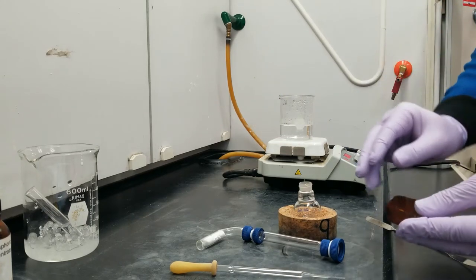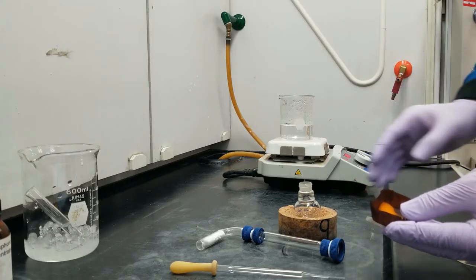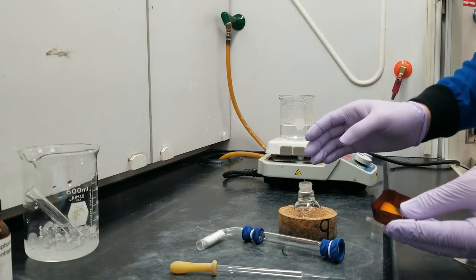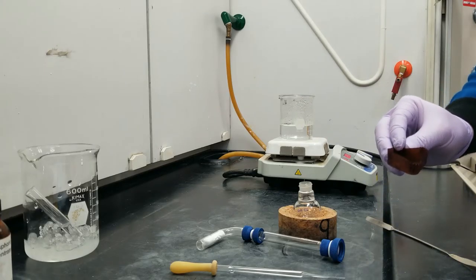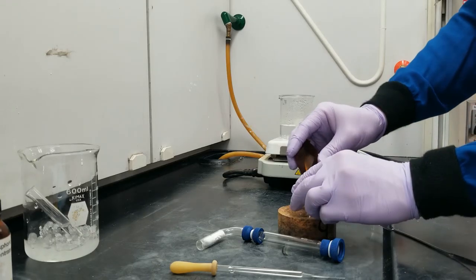And when we introduce the negatively charged rings on the ferrocene to the positive dipoles on the carbonyls of the acetic anhydride, they can form a carbon-carbon bond and react. And that will leave us with an acetylated ferrocene. So, ferrocene's going to go in.